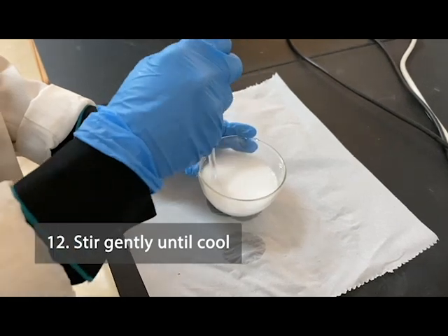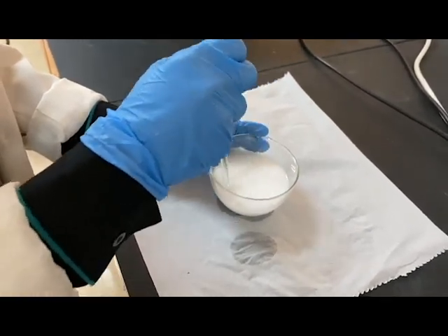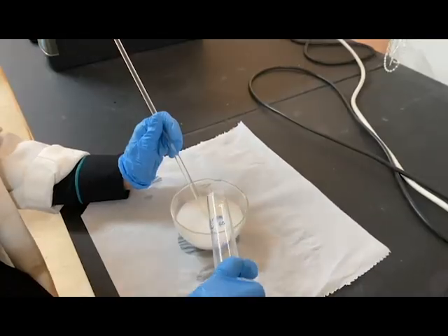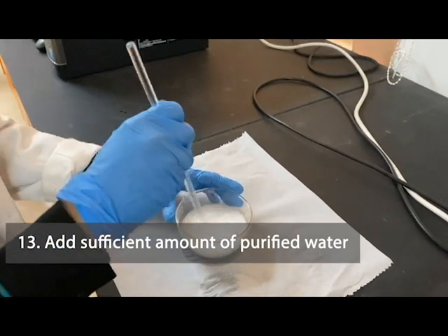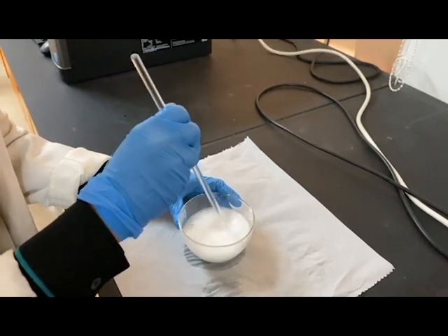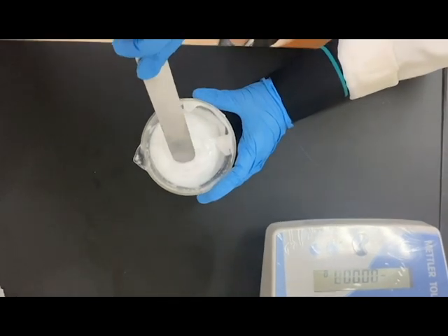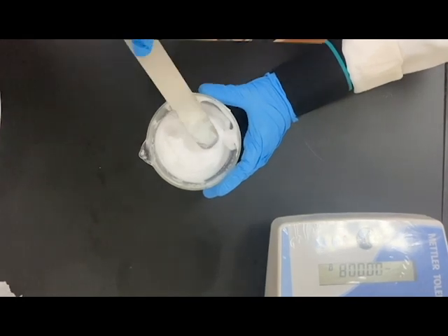Stir the mixture gently until cool. This is how your final product should look like. From liquid, it has turned into a cream of cake consistency.